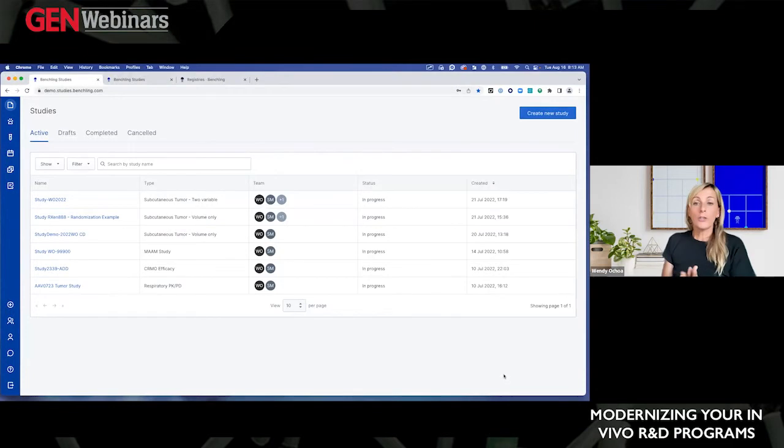I have logged into Studies. Studies, as you have heard, is a cloud-based platform, and so through a modern browser you can access your account in Studies from any device you have connected to the internet. So this is my account, and permissions can be set up at the level of the account itself and also at the level of a study, as we are going to see in a second.